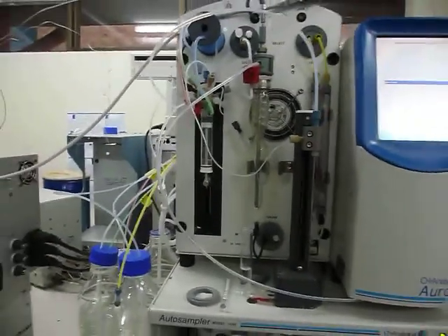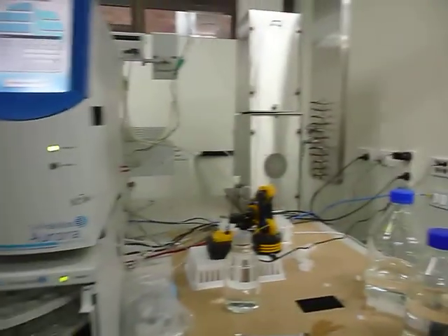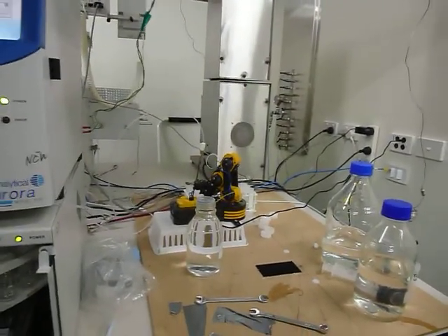So now the Aurora, the TOC analyzer, is finalizing its measurement, its operations. The robot's there waiting, and the software here will be stopped at any moment.